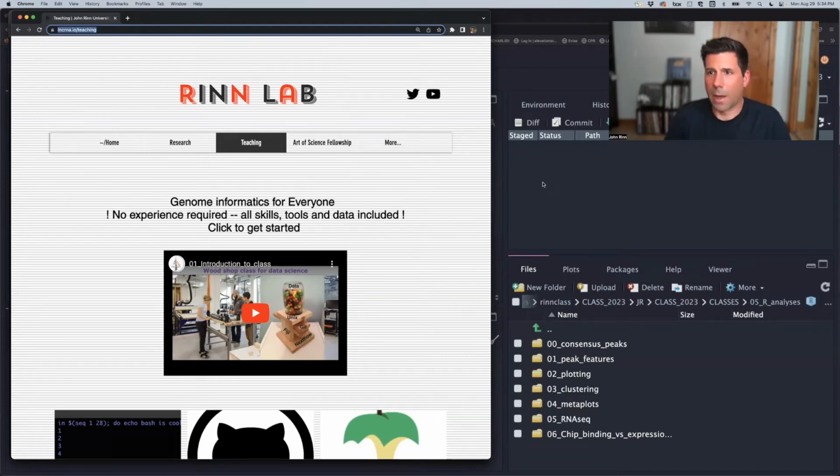Hello, everybody, and welcome to our class on starting to analyze our custom ChIPseq data. We've been learning a bunch of fundamental skills, curated a set of DNA binding proteins, and ran the NF Core ChIPseq pipeline to get the peak files for that collection of proteins. I made my own, you'll have your own, but the same code will work on all of ours.